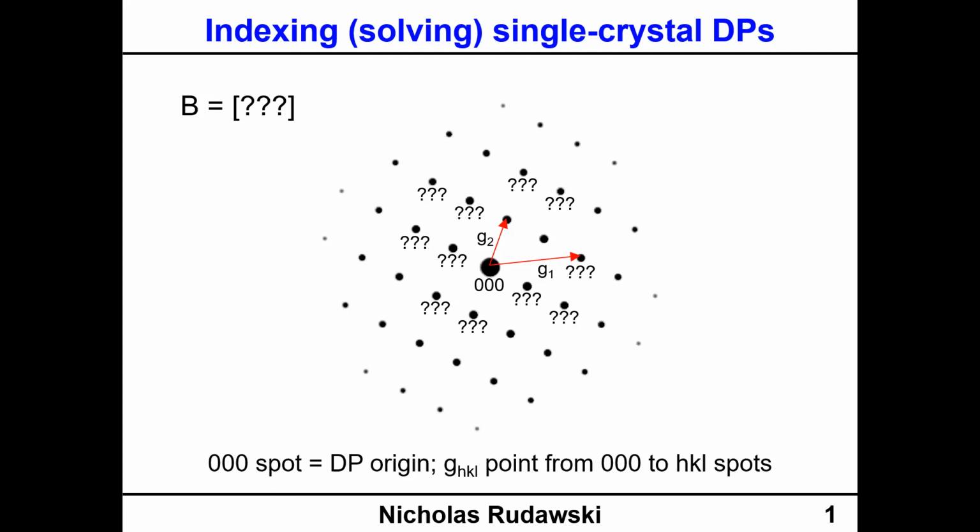And what we're going to talk about today is something that has been requested for a while. This actually goes back to the video that I did a couple of years ago about zone axis alignment. The question being, okay, you're talking about the importance of aligning to the zone axis, but how do you know what the zone axis is? In that example for that video, I said this was a 110 family zone axis for silicon. How do you know what it is? So this gets us into what we call indexing the diffraction pattern.